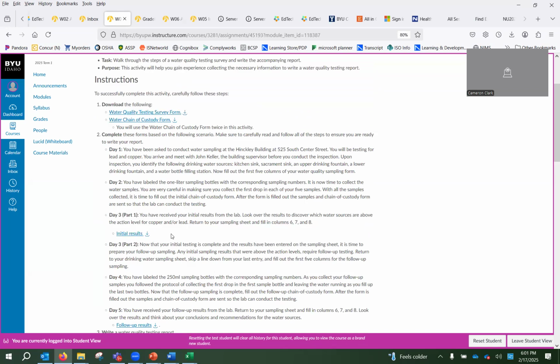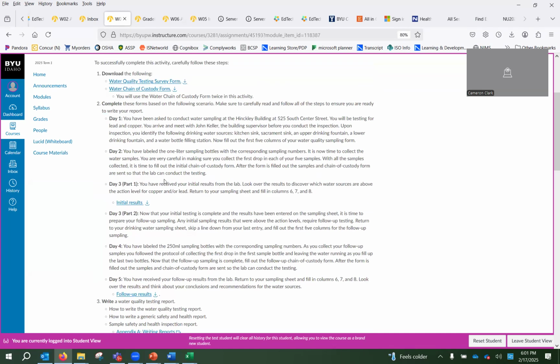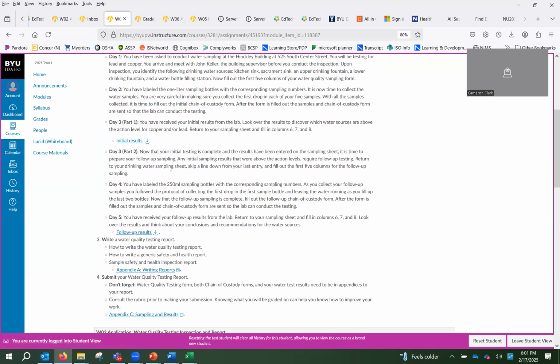So, all right. So we got the initial results. We recorded those on the survey, the testing survey form. We've also completed the chain of custody form. Okay, now we're going to go down and do a couple of important things to kind of wrap this up, or the sampling portion anyway. So everything is in the sampling sheet.